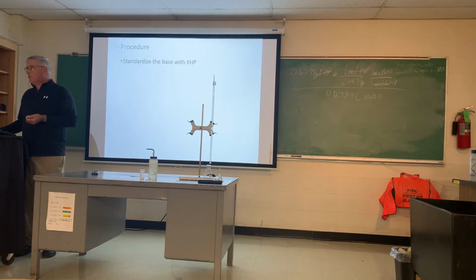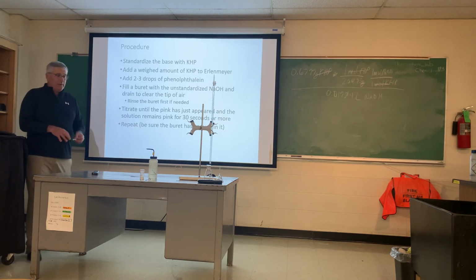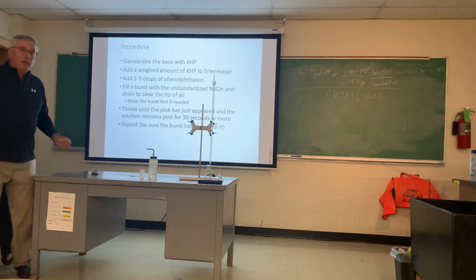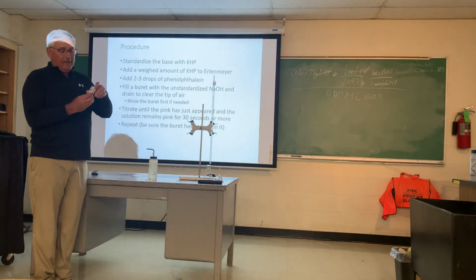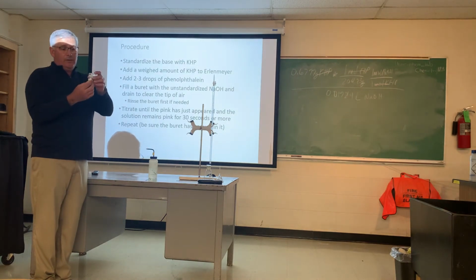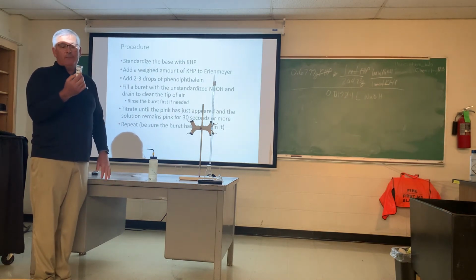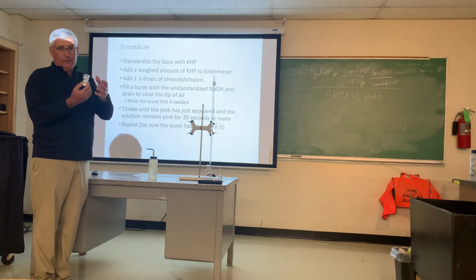All right, procedure-wise, a couple of things that are important. I'm just going to pull all these up. And so to standardize with KHP, there's a couple things. The lab handout starts with talking about a weighing flask. Now these are breakable, they are glass, so be cautious with them. But these will be dried in the oven to have the KHP be very dry, and then be cooled in a desiccator and then capped when they're put by the balances.